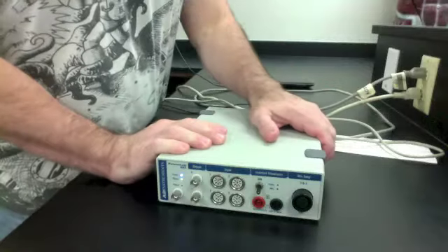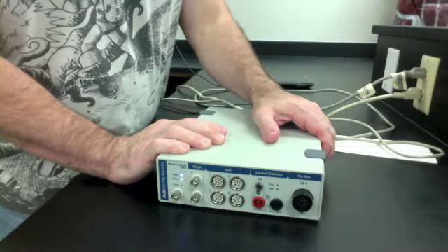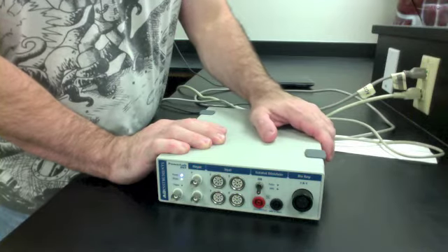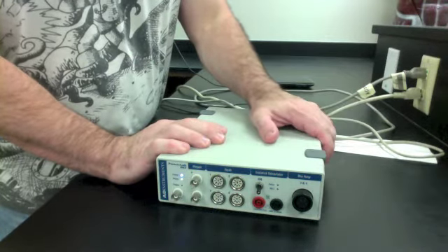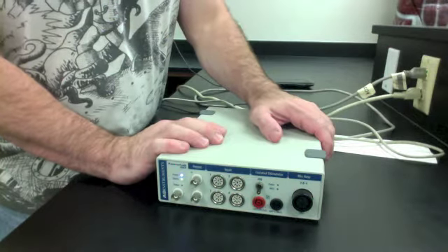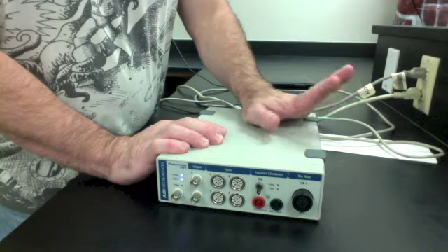So we're going to be using this. This is an ADI data acquisition system. There are several different types of these sort of systems. And essentially what they do is they collect data digitally and then display that on a computer screen. And I'll show you the computer screen in a second. This should come set up when you come in, right?